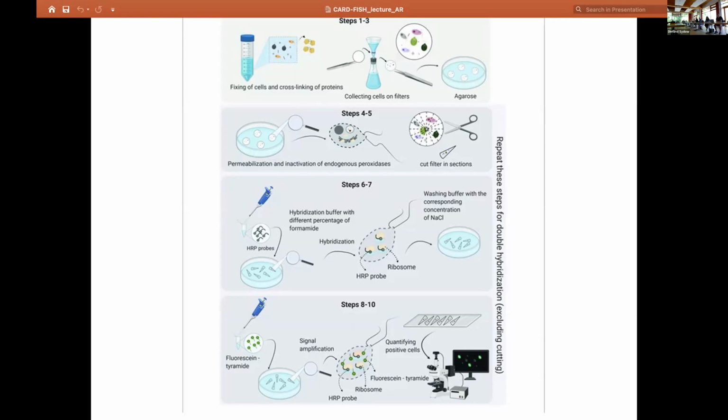So you have to find the perfect conditions, and you have to do some tests to ensure that you are highly specific, but not too much, okay? Again, if it's published and the probes are already tested, you will find these conditions. Otherwise, you have to test it.